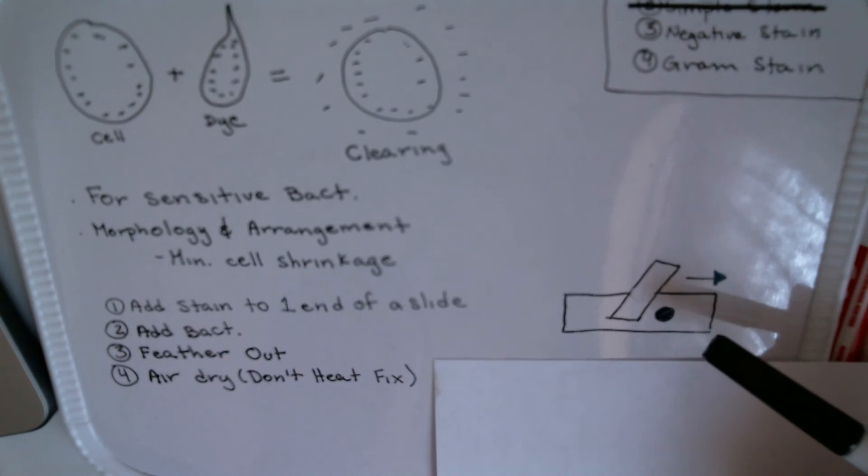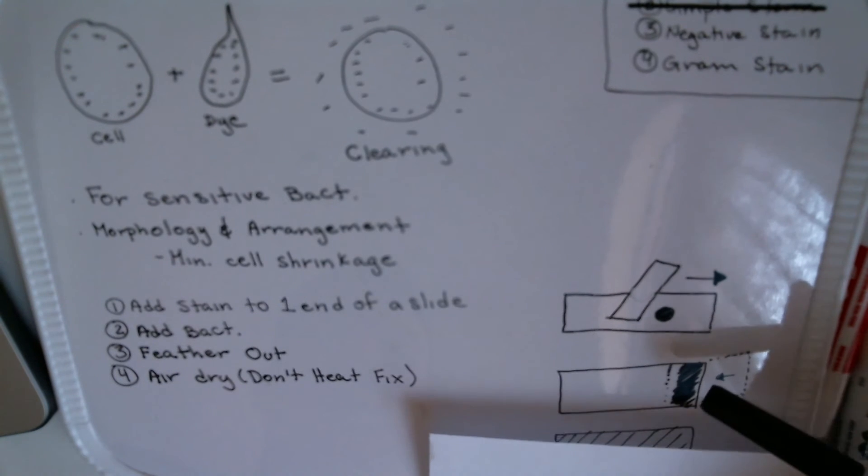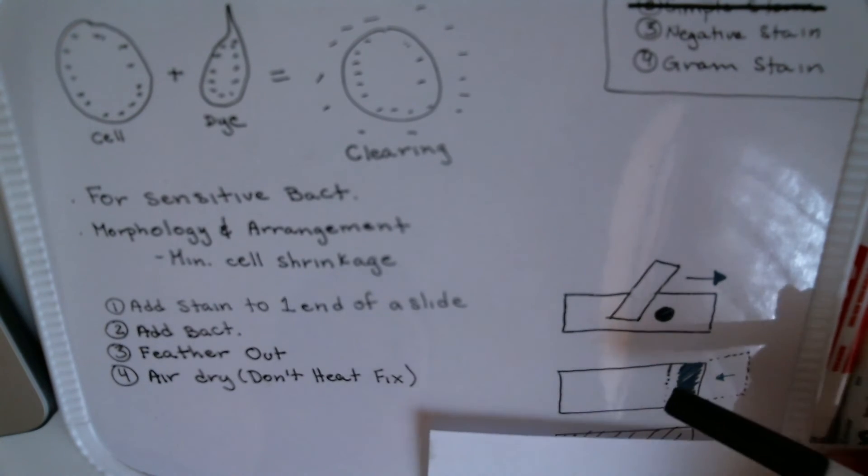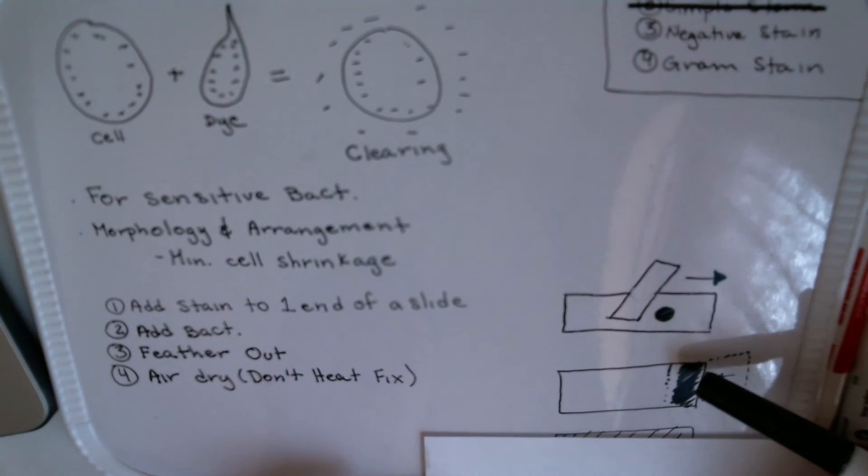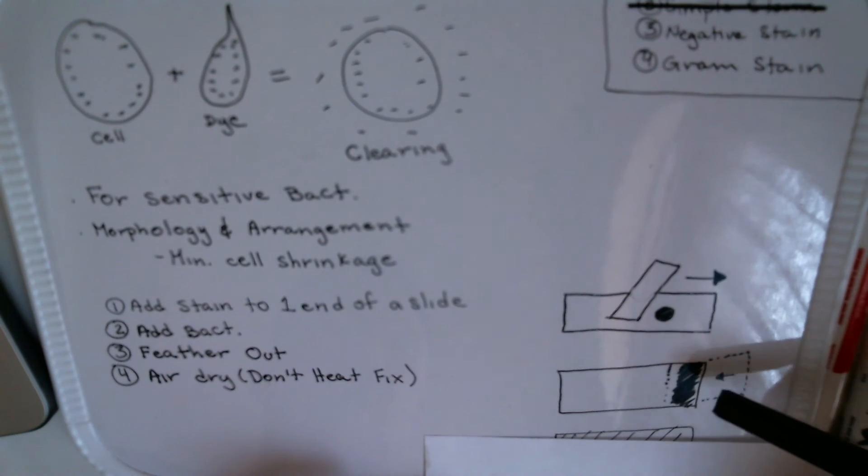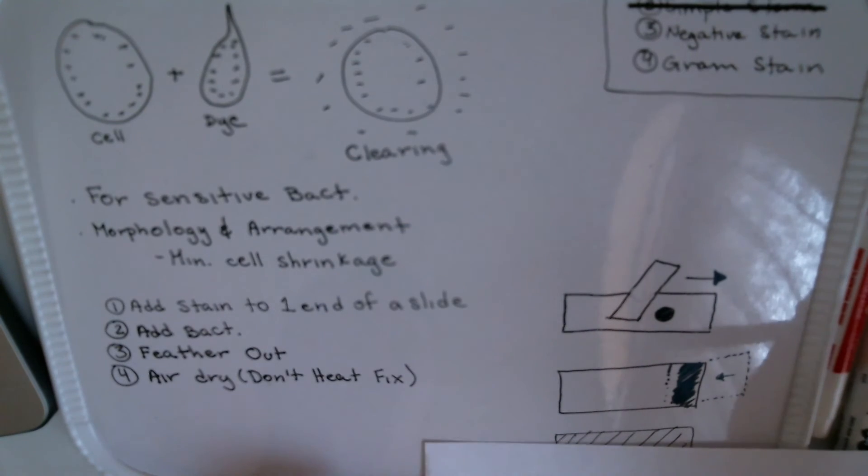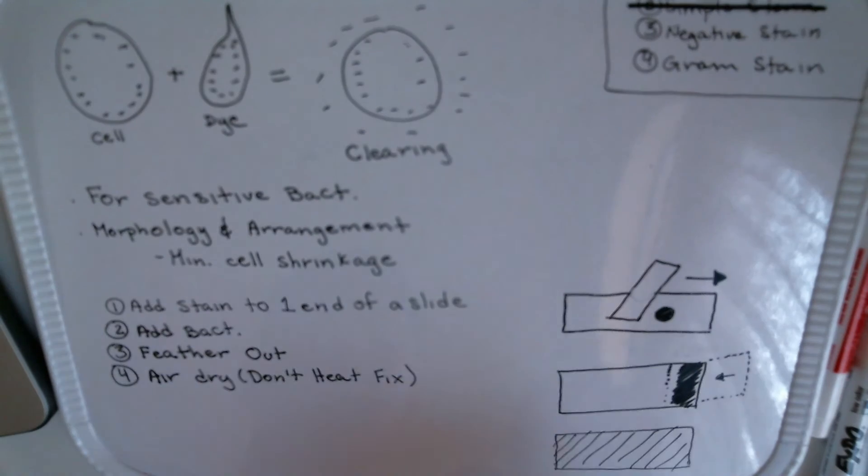We're going to take another slide and press it against the slide that has the bacteria and the dye, pull it back to the edge of the slide until it runs to the edge. As it does that, we're going to push the slide forward with our other hand, and what we do is create a very thin one-cell-thick layer of the dye and the bacteria.